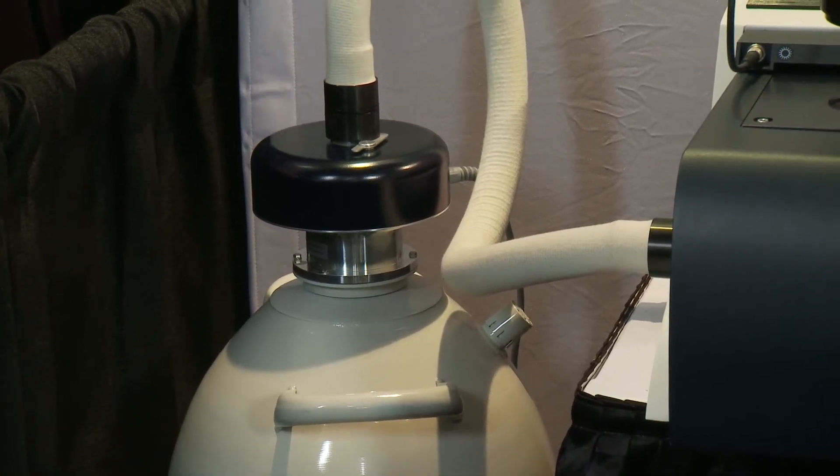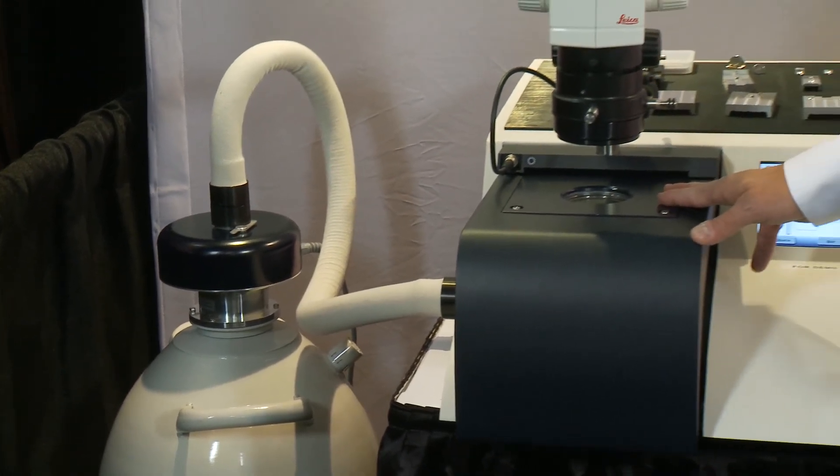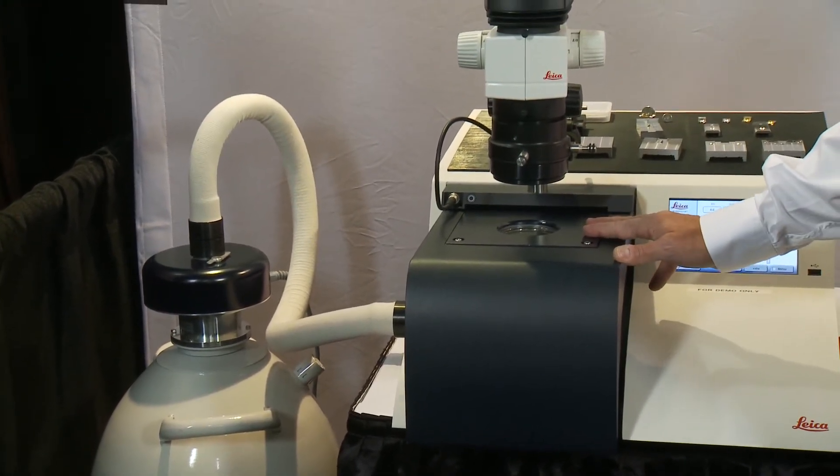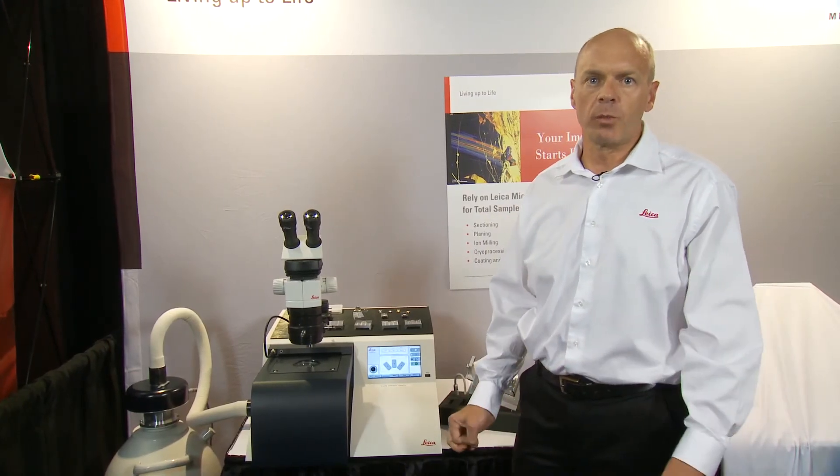This allows us to work with the samples right down to minus 150 Celsius, so that if the sample is heat sensitive, it's not damaged. The instrument is primarily a slope cutter for SEM sample preparation.